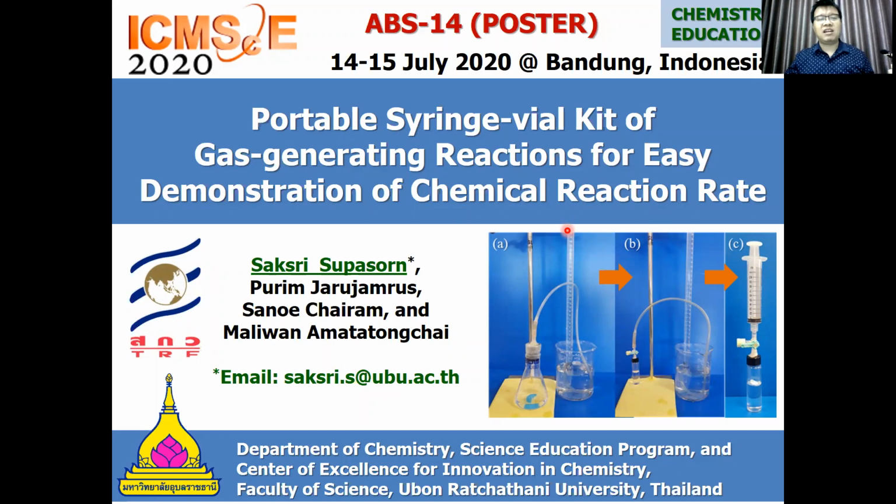I and my colleagues would like to present our research study entitled Portable Syringe-vial Kit for Gas Generating Reactions for Easy Demonstration of Chemical Reaction Rate. We are from the Department of Chemistry, Faculty of Science at Ubon Ratchathani University of Thailand.